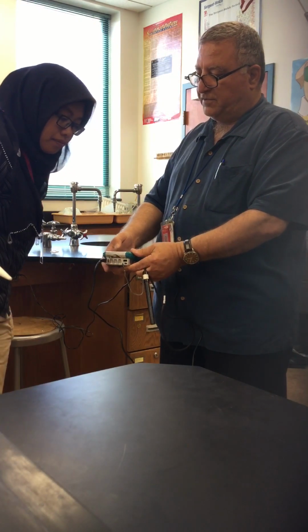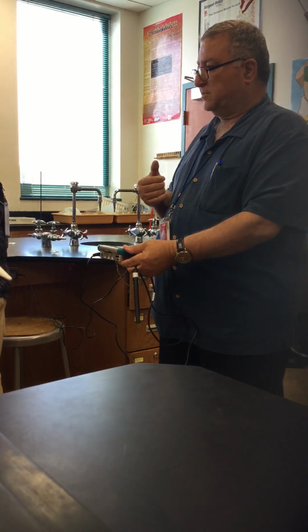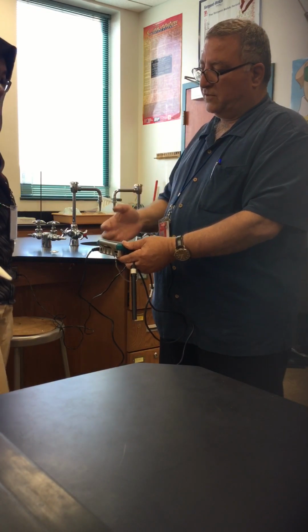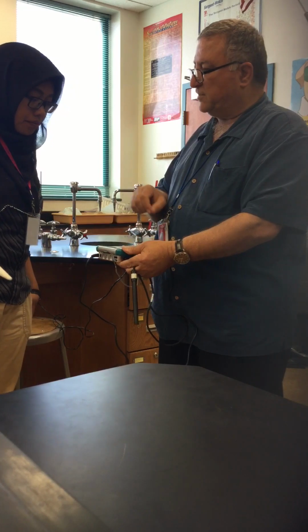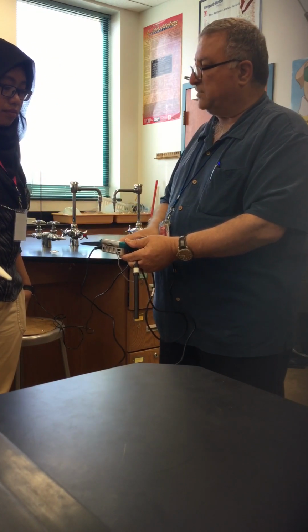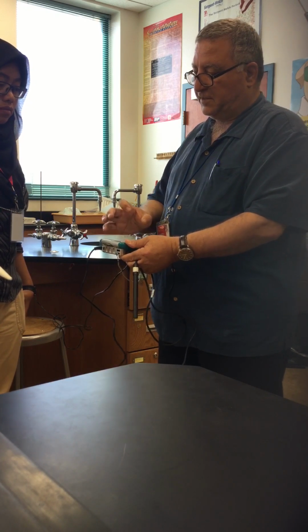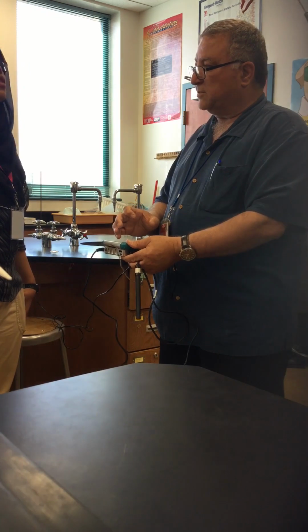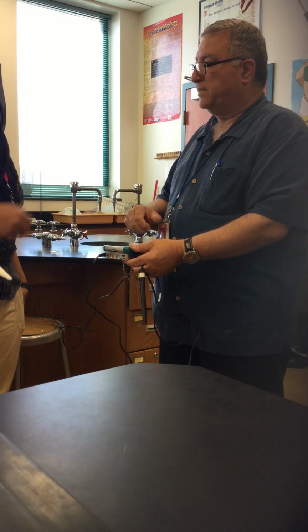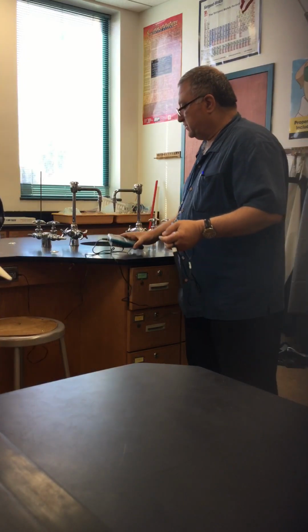If you hit that, it will give you the data in a table, but I don't need that for the experiment we're going to conduct. Or you can have it graph the data for you. You connect this to the computer and print the graph, or a lot of times I just have my students take a snapshot of the graph from here, and they can print it at home. So now we are ready to go.